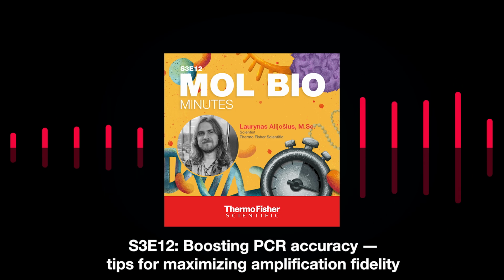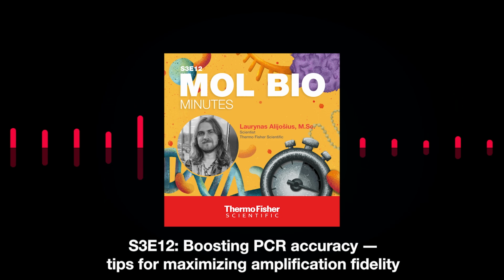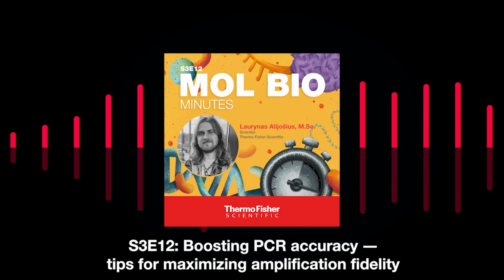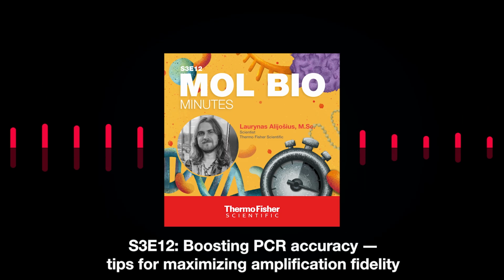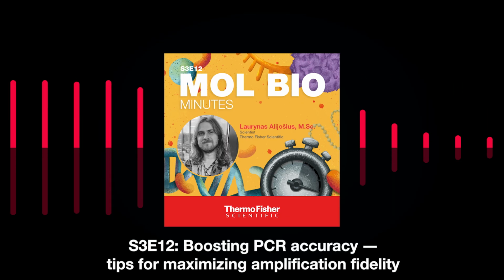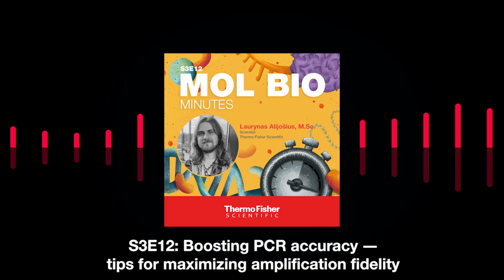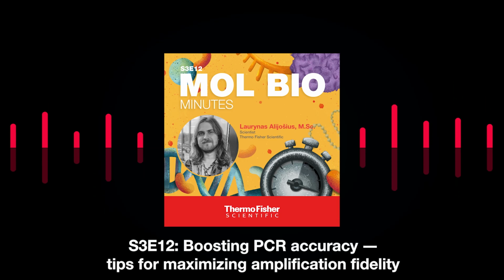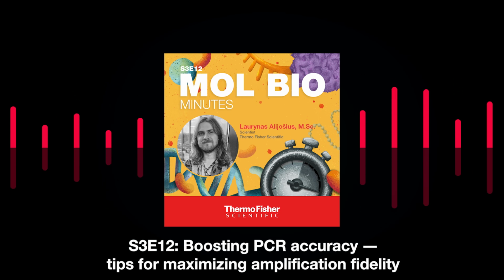For your reaction mix, the most convenient option we believe, what we love to do in our lab, is to use ready-to-use PCR master mixes or buffers, because in that case we have an optimal reaction mix composition, and we are avoiding additional pipetting errors that we don't need, or we lower the risk of contamination of our samples. And also, we just save some extra time for coffee or for some chatting. So that's nice, or just to go home earlier.